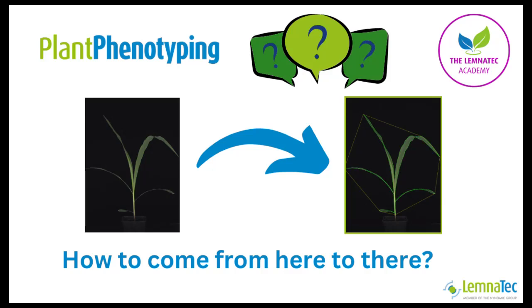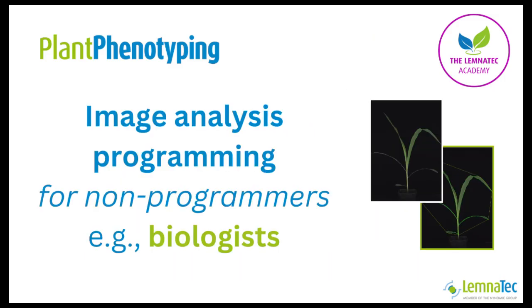Hello, this is the LemnaTec Academy with a key question in plant phenotyping. You have got phenotypic images and now you need to get them analyzed. So how to come from here to there, from a taken image to an analyzed image? Especially if you are not a programmer and there is no programmer available in your working area.